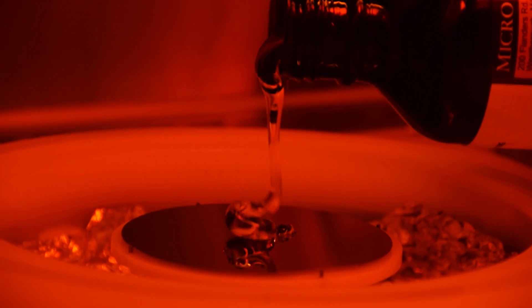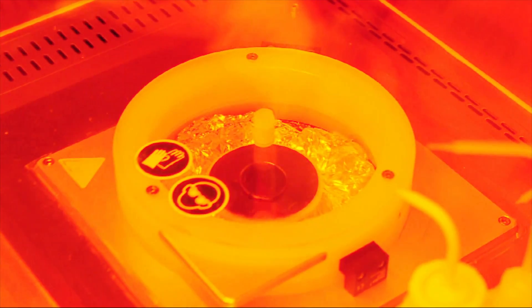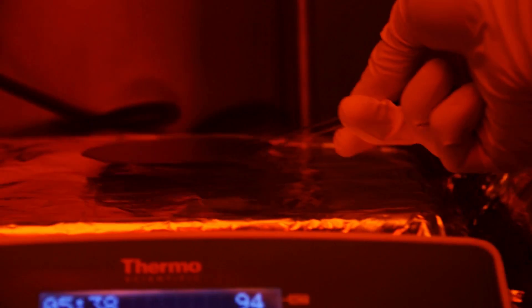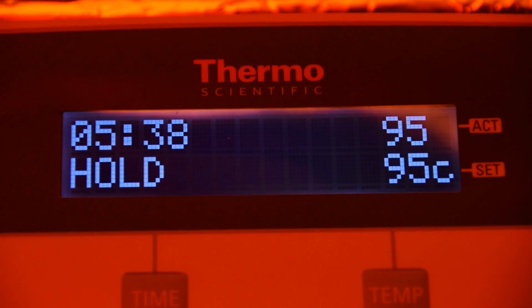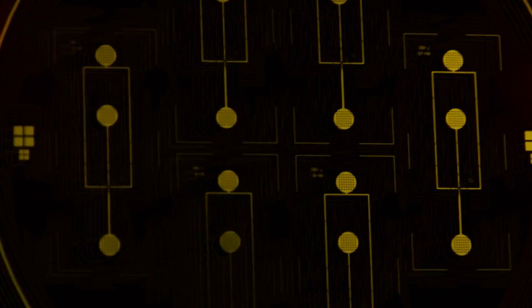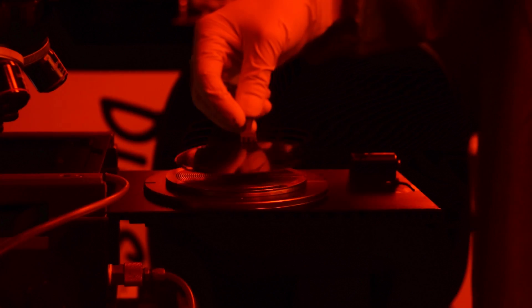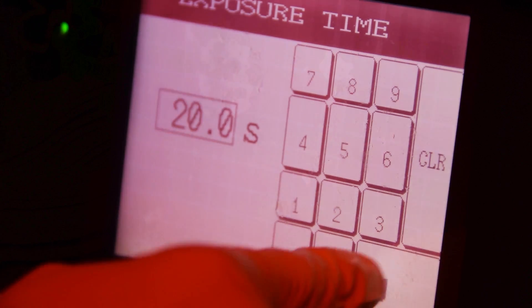So here we go. We take a silicon wafer and pour resin on top. We spread it by spinning it very fast and heat it up to solidify the resin. Then we take the mask and put it in the lithography machine. We also put our wafer with the resin.